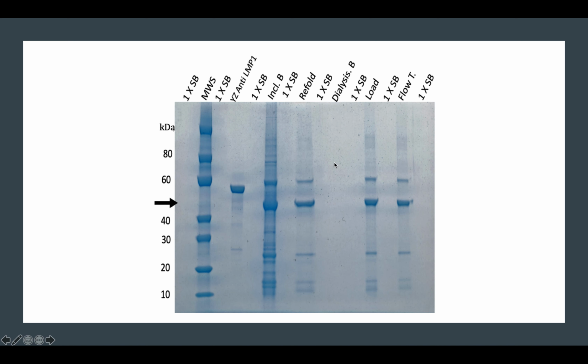Dialysis buffer, there is no band. This means that the protein did not leak into the dialysis buffer. We continued on with the load sample. The load sample contains our protein. This is what we will be loading into the column for anion exchange chromatography.